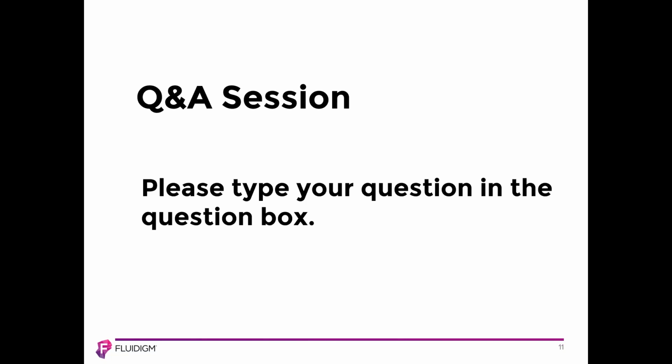Okay, and then there's one question here for mass cytometry. Can you label streptavidin with metal tags for tetramer detection? So this is an interesting question.